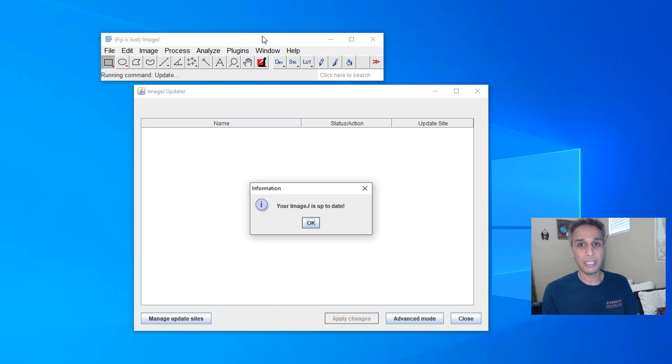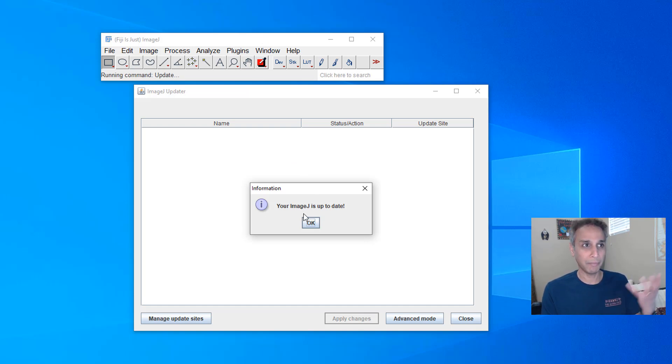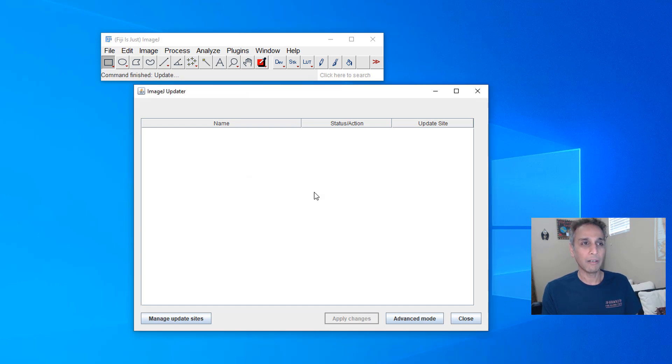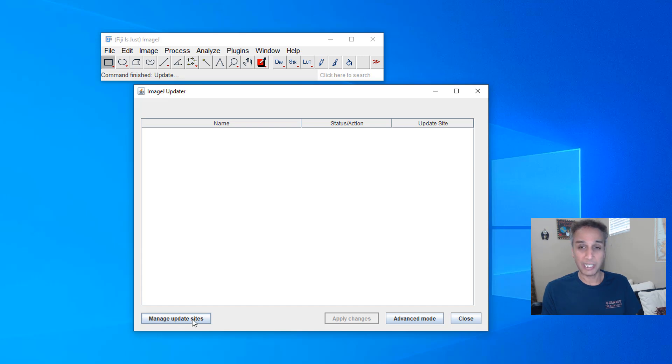I kind of do this occasionally like at least once a week so I am up to date and apparently my ImageJ is up to date so nothing to update there.